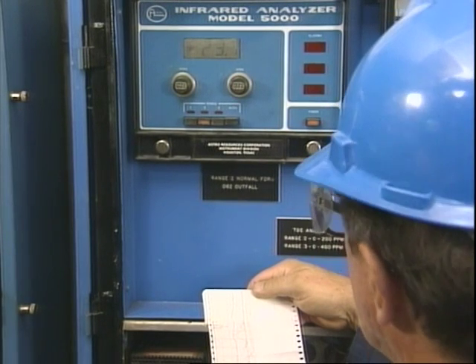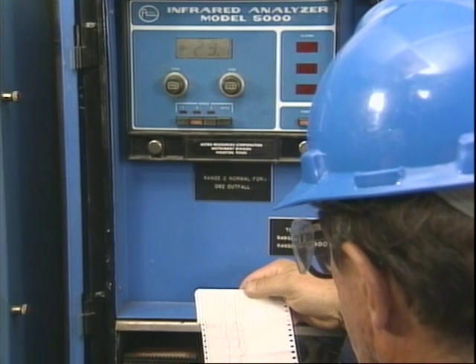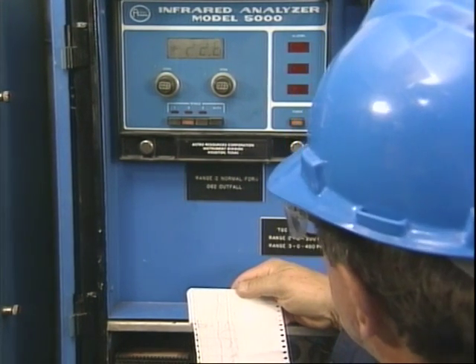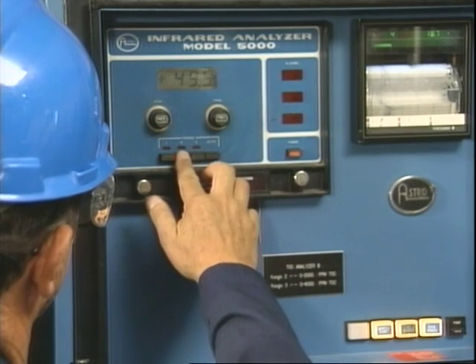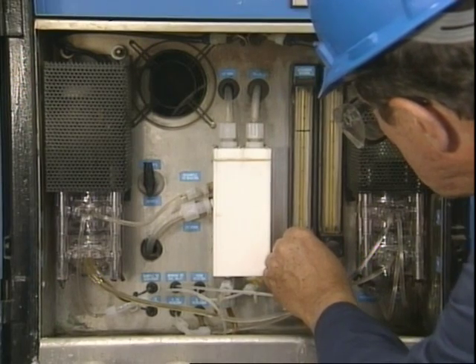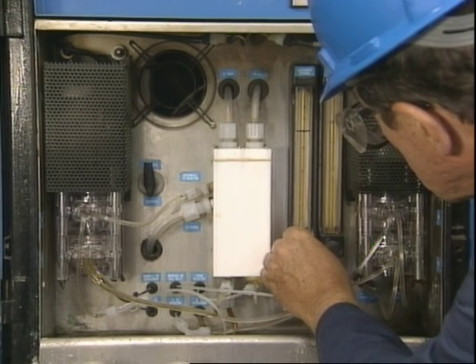The analyzer should be calibrated on a periodic basis and after maintenance. Since process changes, environmental changes, or element aging can cause analyzer readings to drift, it's important to check whether the readings are still valid. These checks include zeroing the analyzer and adjusting the span. For this analyzer, sample pump flow is checked to ensure the proper amount of sample is drawn into the sample cell.